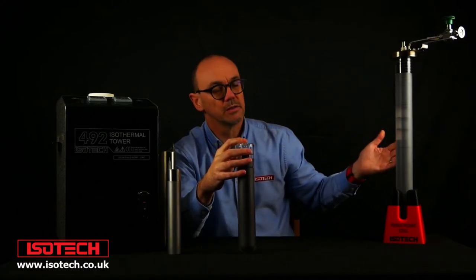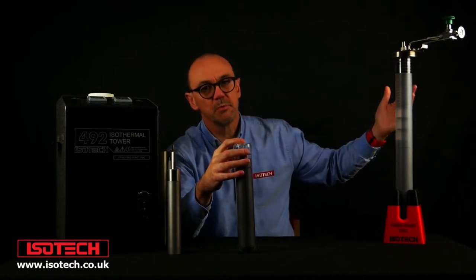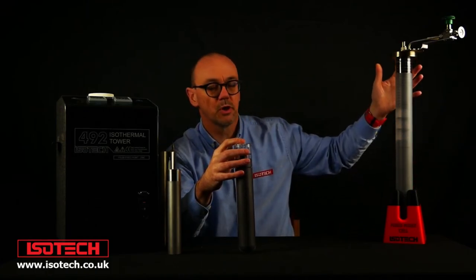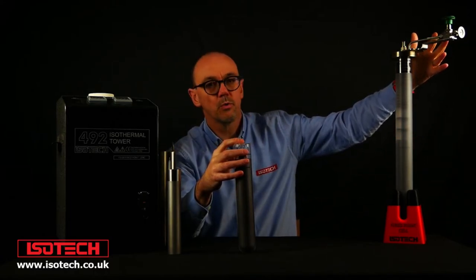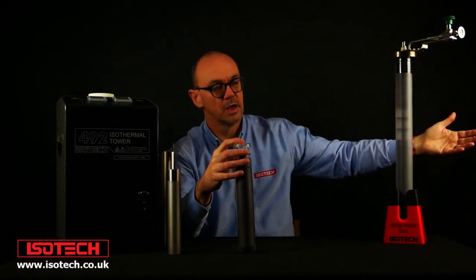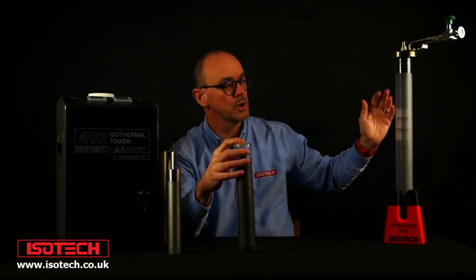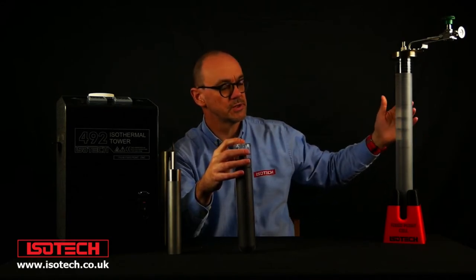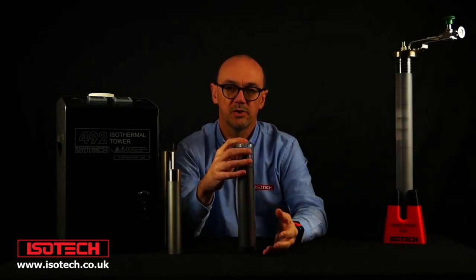But this cell is an open cell. It's a similar construction — we've got a graphite crucible with the pure metal — but you can see it's in a much longer glass tube with a port. This would be connected to a manifold which enables us to vacuum out the cell, then backfill it with an inert gas and set the pressure. With an open cell we have the advantage that we can measure and set the pressure inside the cell, which is an advantage over the sealed cell where you can't measure that pressure.